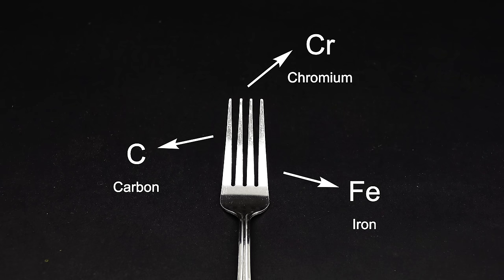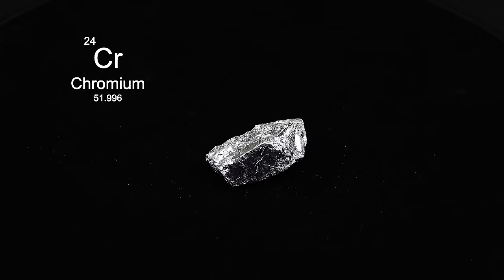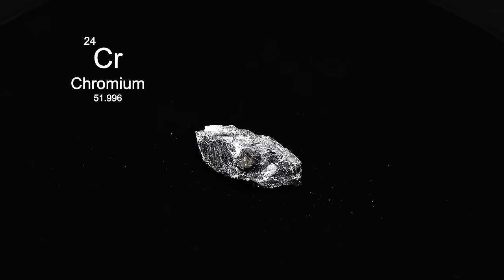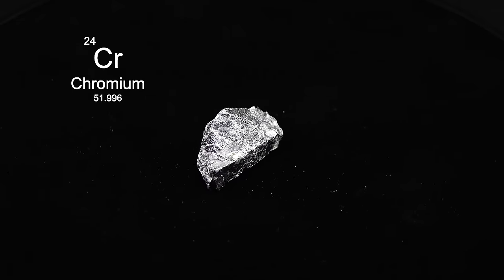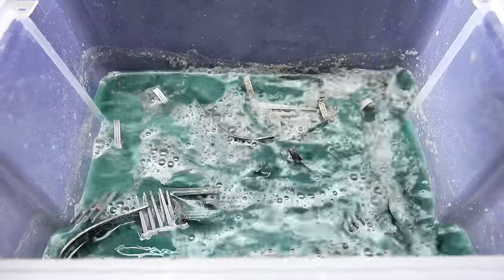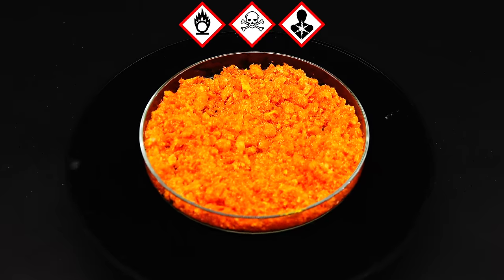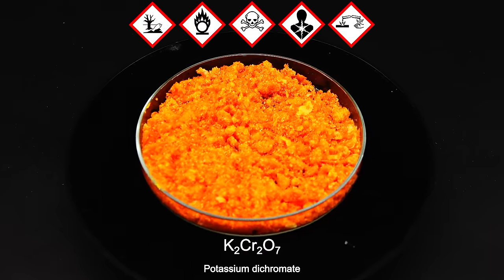The iron and carbon aren't really that interesting because they are kind of everywhere. The chromium, however, is where things get really cool. Pure chromium is a light and shiny transition metal lying near the middle of the periodic table, and it turns out that it has some really colorful and unique properties. In this video, I want to try separating it from all the other fork components and turning it into a toxic, carcinogenic, oxidizing, corrosive, and just overall deadly orange compound called potassium dichromate.